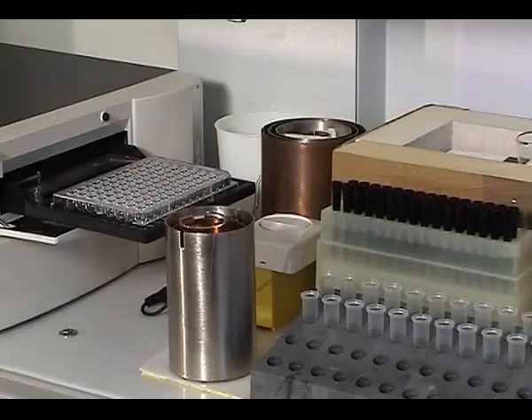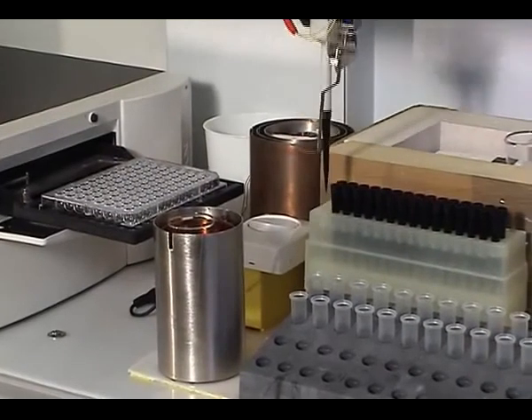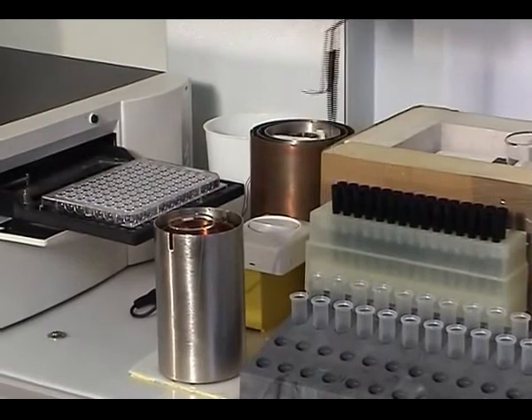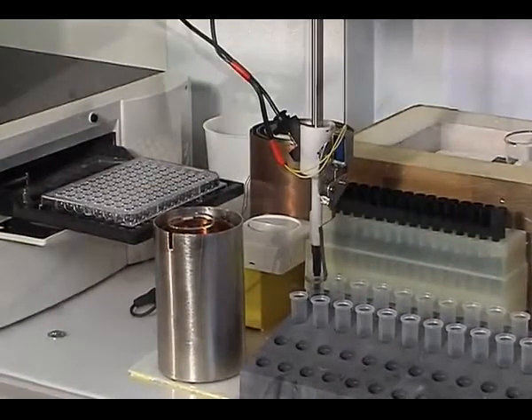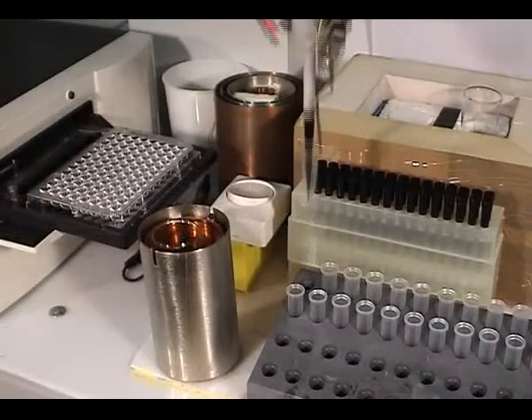Now the machine is working. It is picking up a tip. Then it will take a tube, an empty tube, and put it into the carousel.